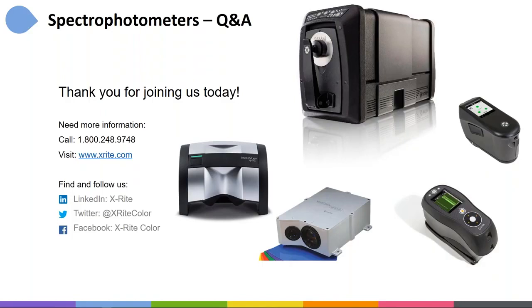First question, can you please explain what D65/10 spin means? If you were to see that nomenclature. Yep, that's very typical when you're looking at color measurement data, whether you're looking at LABs or delta E's or color differences. The instrument measures reflectance, but ultimately we need to calculate what the color looks like under a specific light, because different lights make color look different.